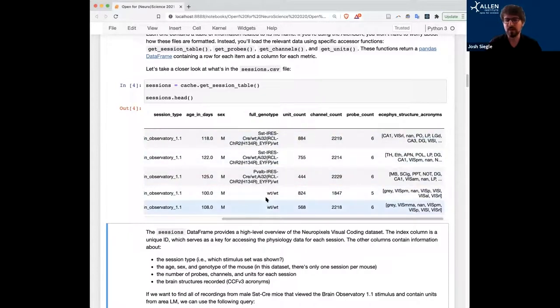In our case, we're using transgenic mice to do optotagging. We have some mice that express channelrhodopsin in specific interneuron subpopulations, and then at the end of the experiment, we shine blue light on the cortex, and we can activate those cells and see which ones express the gene of interest. But we also record all the activity of the unlabeled cells.